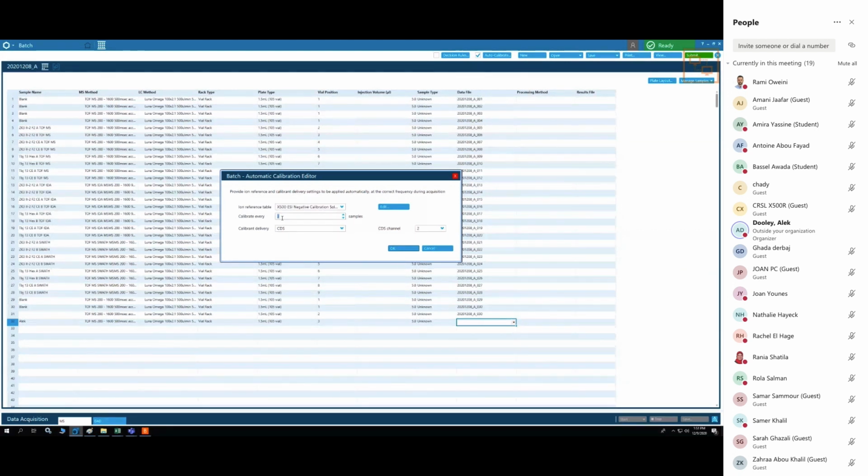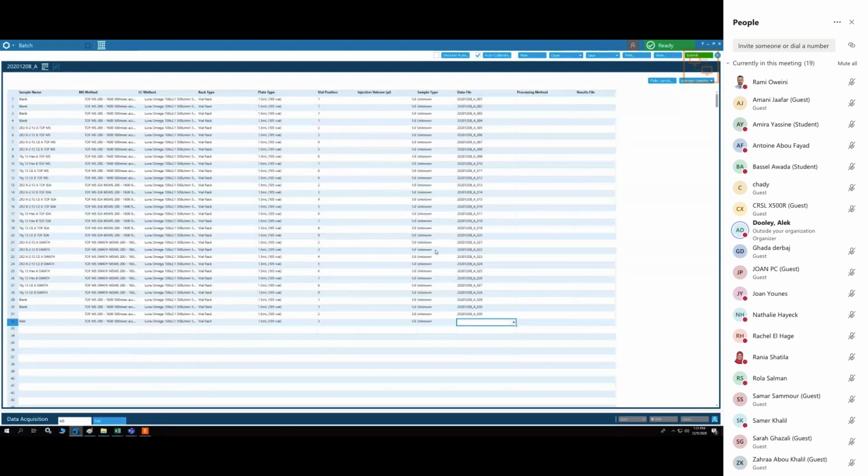I guess for the beginning, you probably won't be changing the methods too much, although we'll see today how it goes. So probably you'll leave it on 3 if you keep using this method, at least for the beginning, to get started. Okay, so that's all I have.